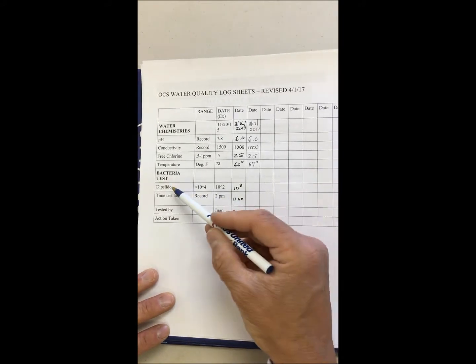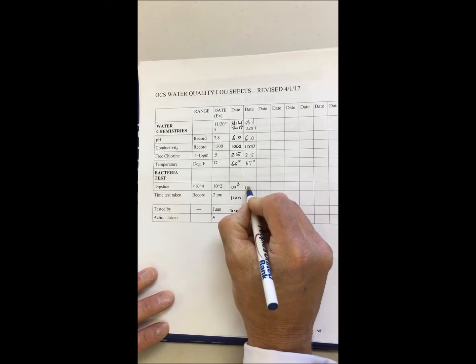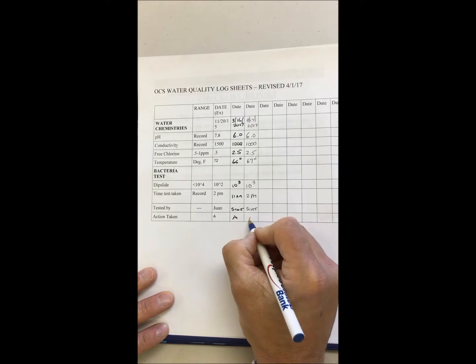The second test we did was the dip slide. We dipped it in. We measured it after 24 hours. In this case, we got 10 to the 3rd colonies, which was great. We took that test at 2 p.m. And then the test was taken by Scott, which is me. And in this case, there was no corrective action needed.